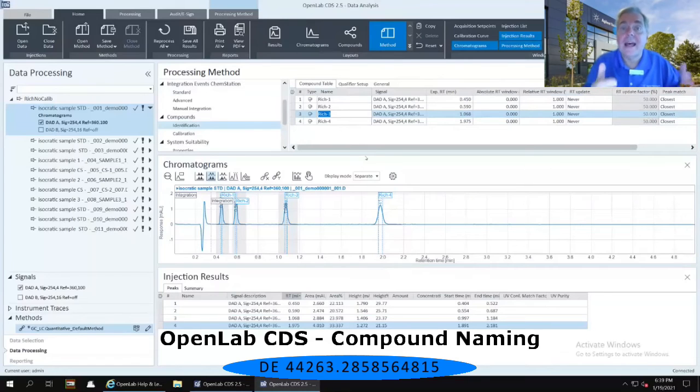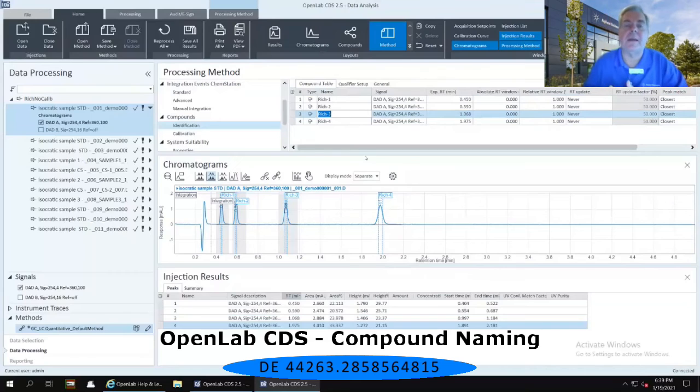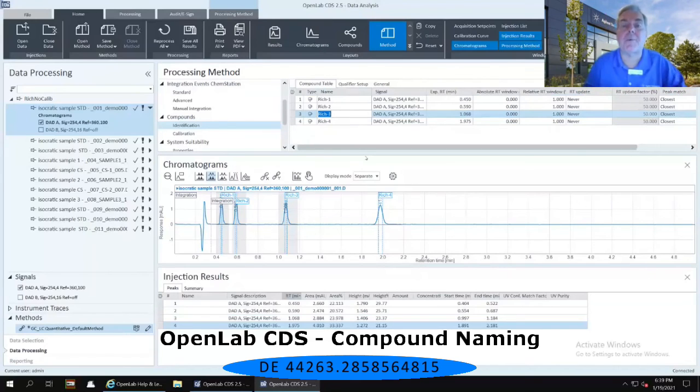After that, I can then create a calibration of those named peaks if I so choose. But they are two completely separate items.